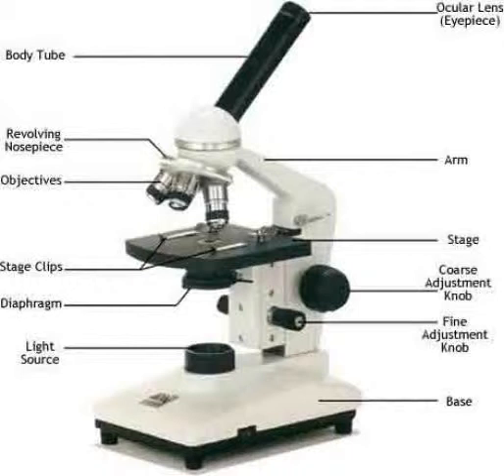Then turn the high power objective into place. If your microscope is properly adjusted, the image should be almost in focus. Use only the fine focus on high power. Adjust the position of the slide if necessary and focus to see small irregularities in the R. Note, using the coarse focus with high power will break your slide. Number 6. Draw the letter R under high power.